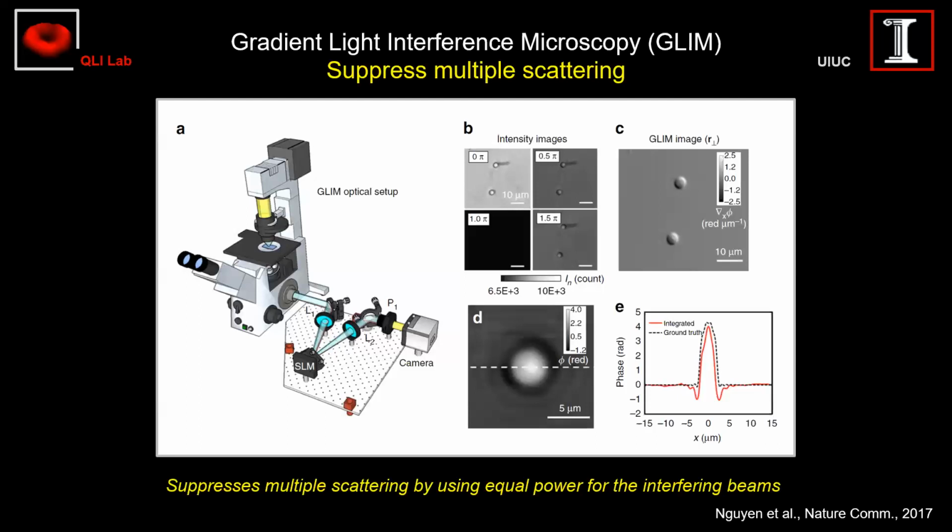So at the end of the day, in my interferometer, I have the two beams that interfere. Remember, one was the incident light that now is very low, and the scattering light, which is now very strong. And the principles of interferometry say when you interfere a small field with a very high field, you get very low contrast of interference. Low contrast of interference means low contrast in my image. So that's exactly what we saw in the previous image.